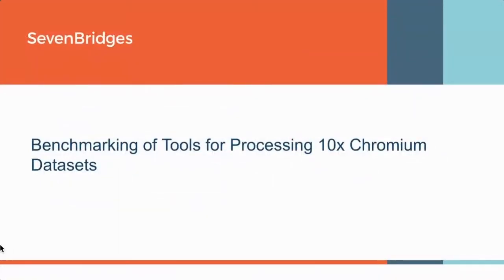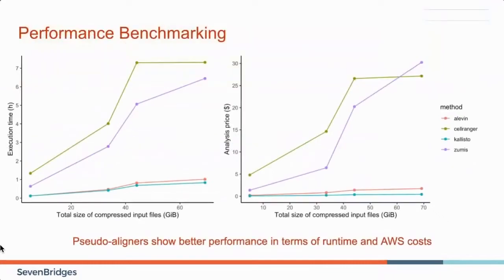Okay, so now that we have gone through the tools and packages available for single-cell analysis, we will present some examples and demonstrations of how they perform. And first, we'll present the results of comparative benchmarking of different tools for processing 10x Chromium datasets. Next slide, please.